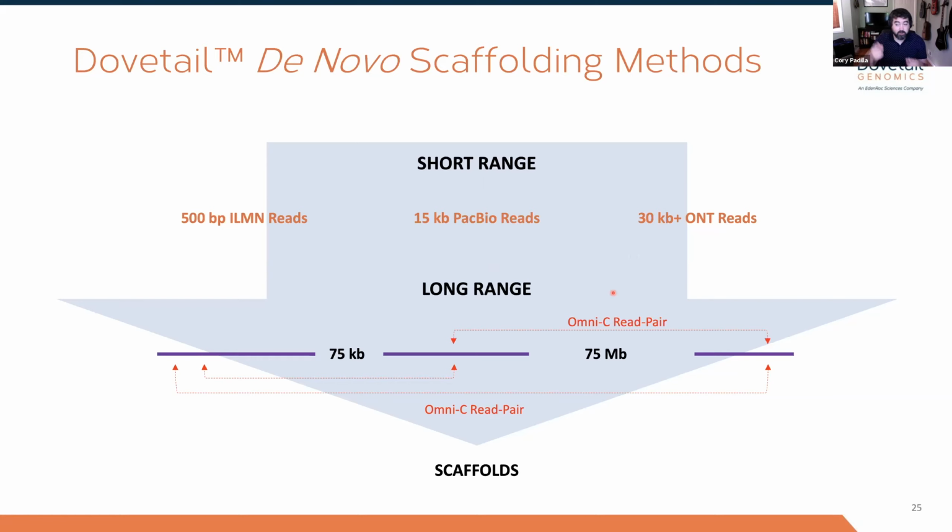Now, what this means for you all, if you're thinking about genome variation, is that one of the more popular ways to detect variants is by doing genome assembly and then comparing two assemblies, where you have your reference genome 12878 and then you take your cancer HCC 1187 and assemble the HCC 1187 and say, where are there differences? Where are there physical distances between these two genomes? So that is a very ground-up approach to assessing genomic variation, right? It is through this genome assembly approach.